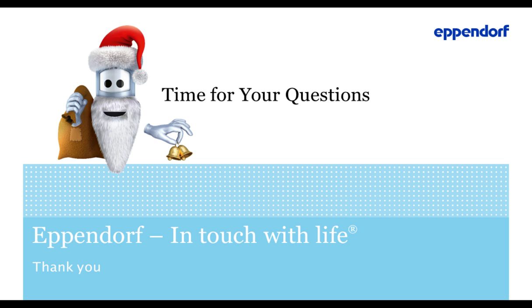The question is, do you recommend working with baffled flasks or non-baffled flasks? I think, Ines, you're a perfect person to ask this question. Yeah, I think this is related to a shaker and shake flask. That definitely depends on the type of cells you work with. Baffled flasks, maybe not all know what it is, have defined cavities on the bottom, or with new designs also a bit further up.